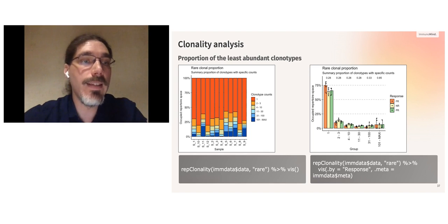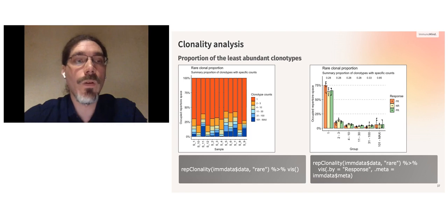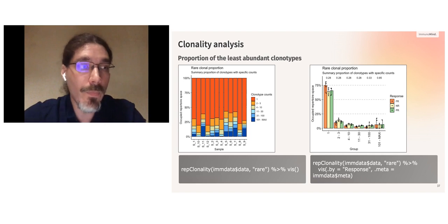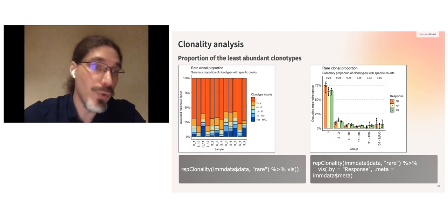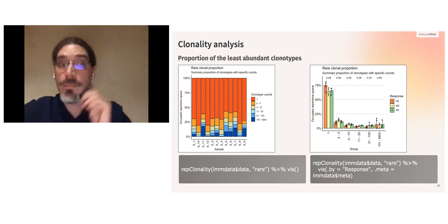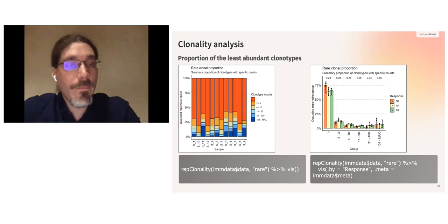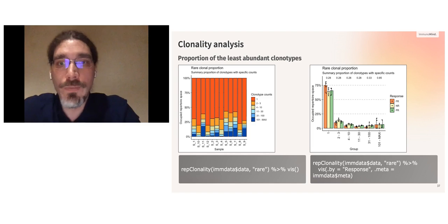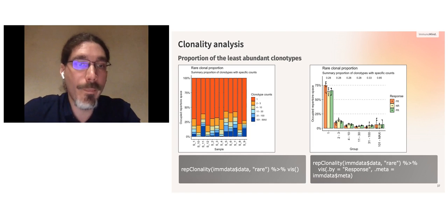And here you can look at anomalies in these very heavy tails, in this distribution of extremely rare clonotypes. It's interesting to see whether there is too much tail or whether there is not too much. This is the opposite of the previous method, so I won't tell about it anymore.